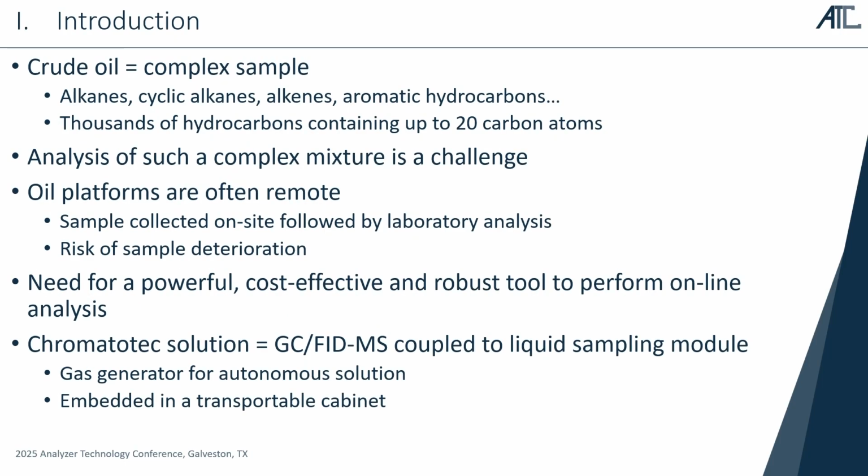So crude oil is a complex sample. It's a liquid complex sample made of a big variety of alkanes, cyclic alkanes, alkenes, aromatic hydrocarbons. So more than thousands of different hydrocarbons containing up to 20 carbon atoms together. That makes an analytical challenge to measure such a complex mixture.